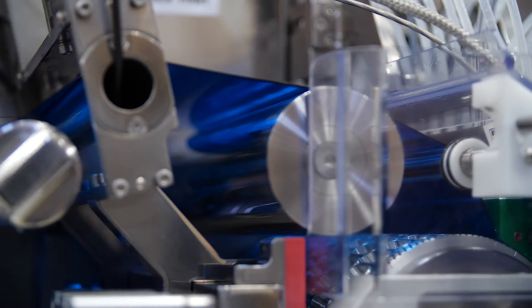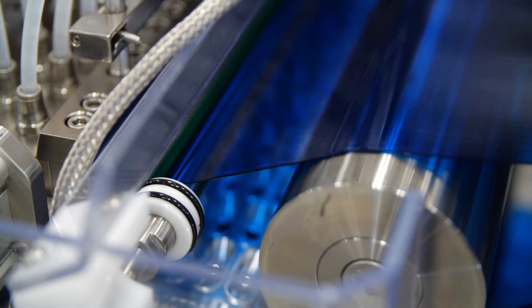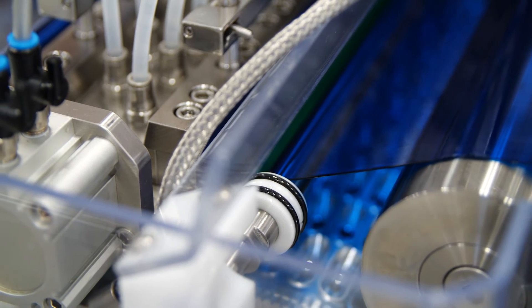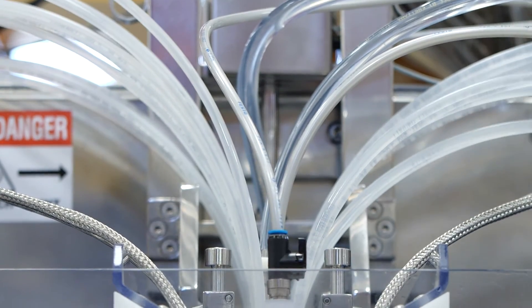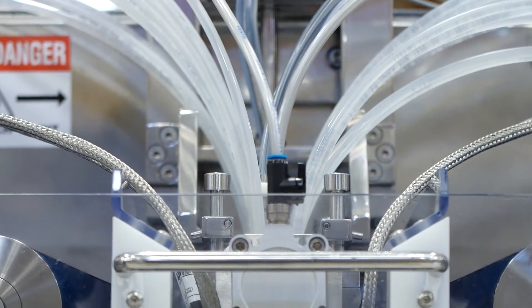Then, the ribbons are fed between the machine's wedge and die rolls. As the two ribbons come together at the lower tip of the wedge and between the die rolls, the fill pump injects the fill material through the wedge's injection holes into the newly formed gelatin.